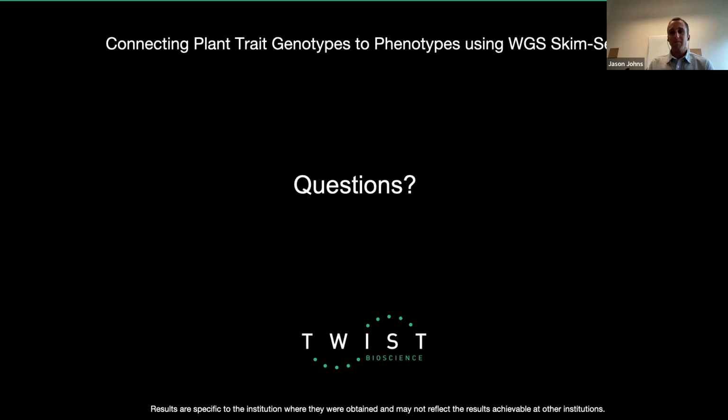Yeah. Okay, the next question is, you mentioned repetitive regions in your genome. Do you have anything to try and enrich for non-repeat or deplete the repeats? So the simple answer to that is that we actually have a couple of new genome assemblies for Aquilegia that have resolved a lot of the issues that we have in our old reference genome.